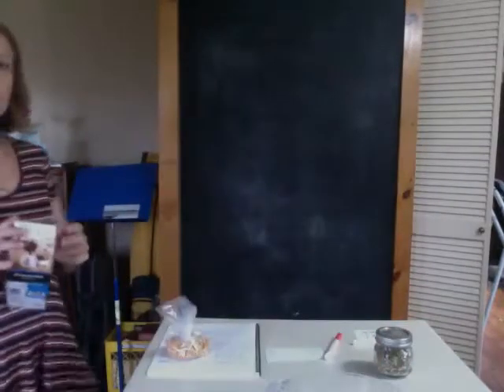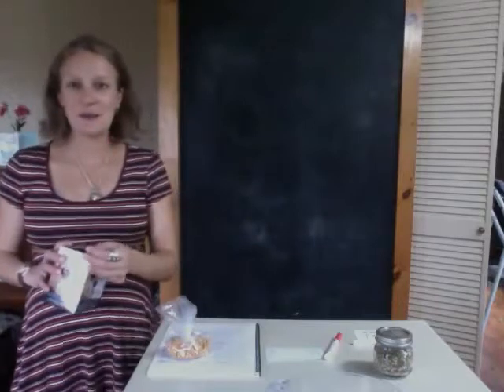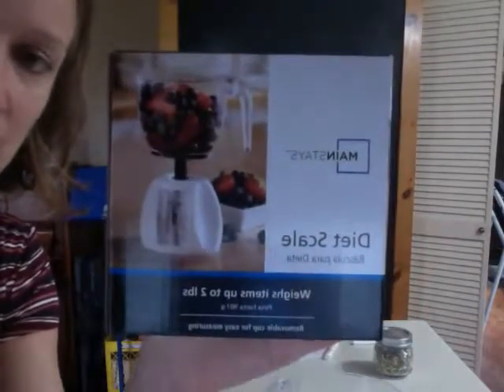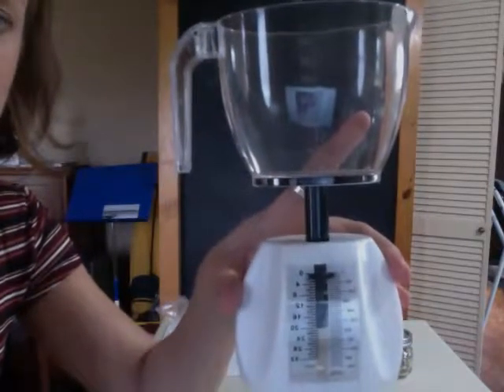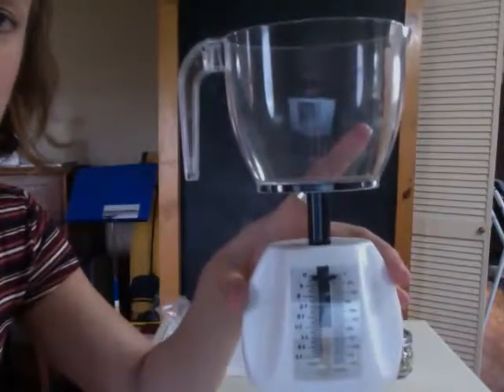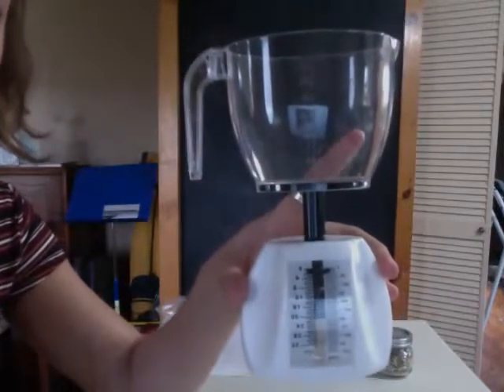So, picking up where we left off, I was going to show you the type of scale that I'm using in this experiment. I got it just from Walmart. It was $5. You're also welcome to get a digital scale that shows digital readouts. For this experiment, I'm choosing to use this. I do have both, and I'll be showing the other in future experiments.